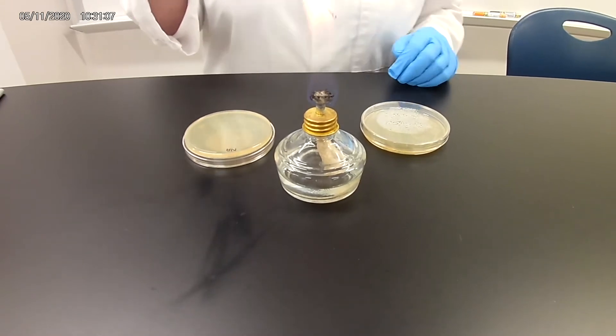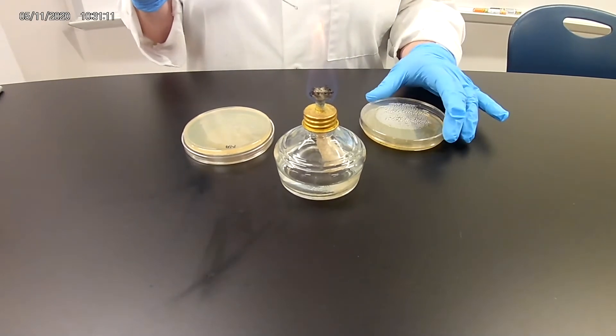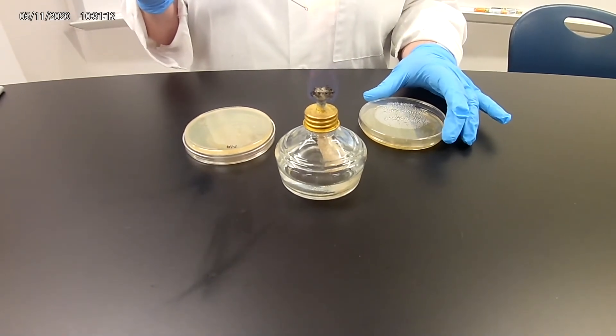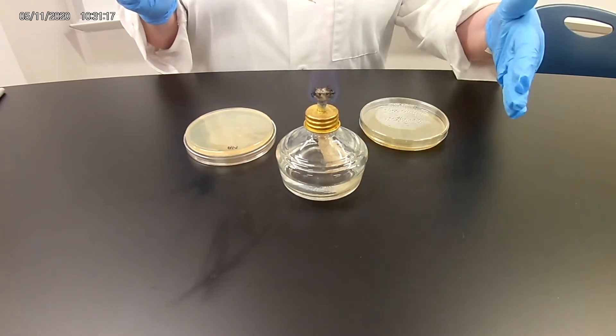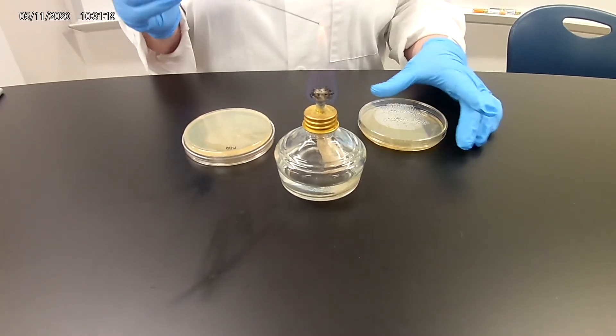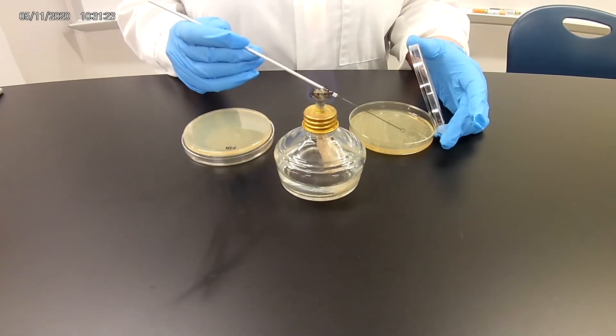As always, we flame the loop until it's a nice glowing red. Let it cool down. The culture we're working with today is Serratia marcescens. Once again, I'm working close by the flame within my sterile area, keeping my sterile technique.